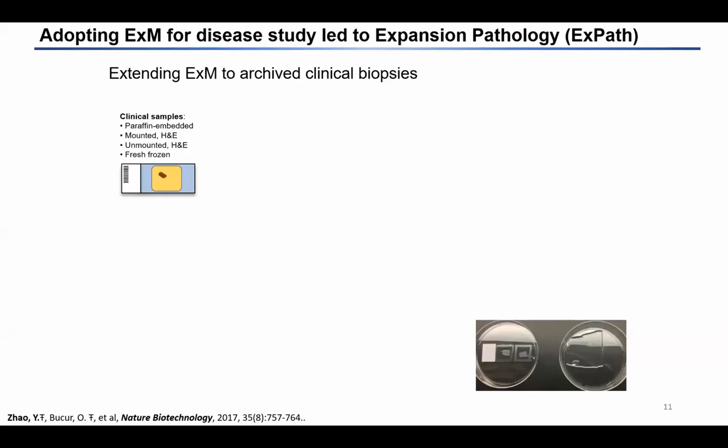Since I was a postdoc with Professor Ed Boyden at MIT roughly 10 years ago, I have been working on translating expansion microscopy for pathological applications. And actually, my first work on expansion microscopy was to develop a technique like that. It's called expansion pathology.